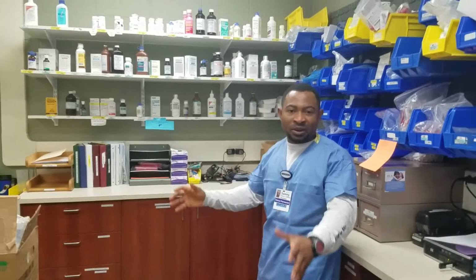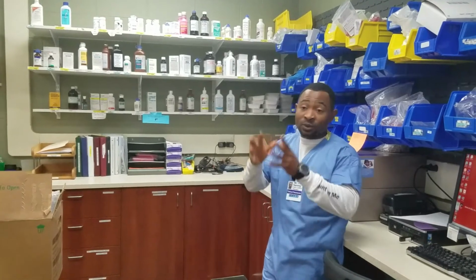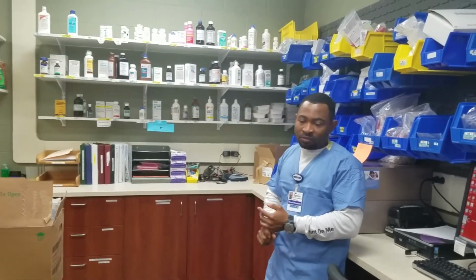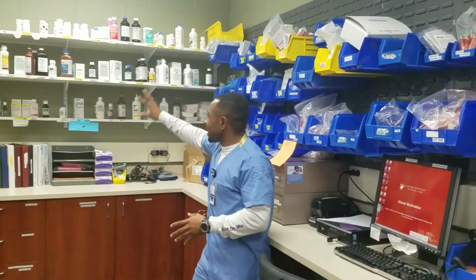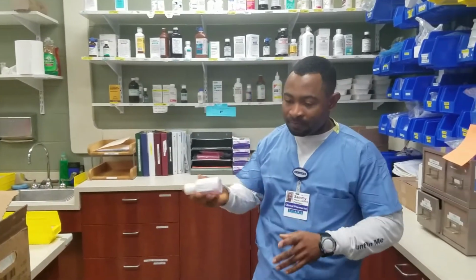Alright, as we continue through our quick tour here in the main pharmacy, one other place I wanted to make you aware of is our extemporaneous compounding section. What we do here, most of our medications that we don't have unit dose, we prepare them here extemporaneously. A good example would be some of our suspensions, antibiotic suspensions. We have them all here in a powdered form, and then we have them all reconstituted and ensure that the stability is also okay, and then we can draw them up in syringes and send up to the appropriate patients.